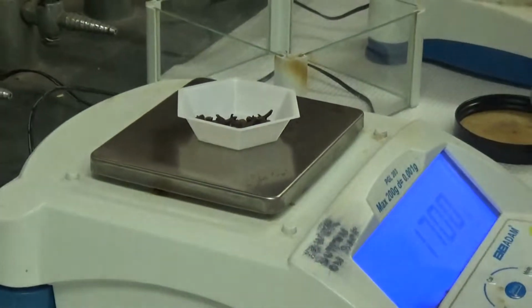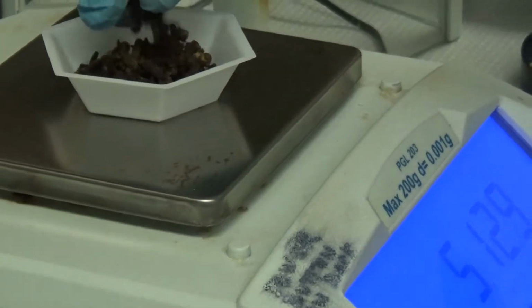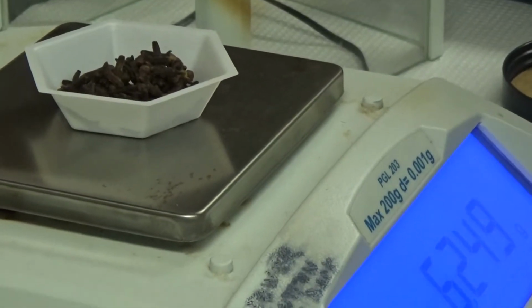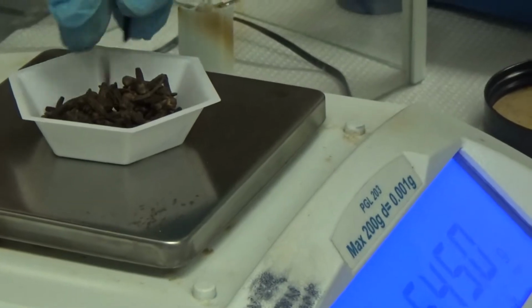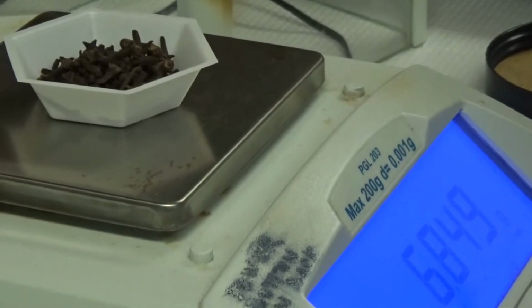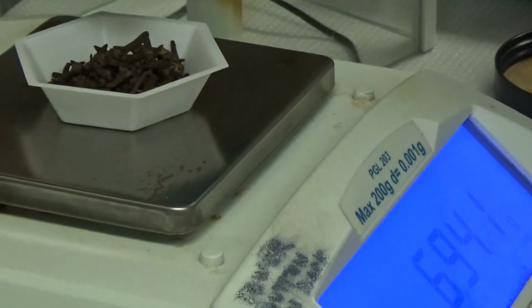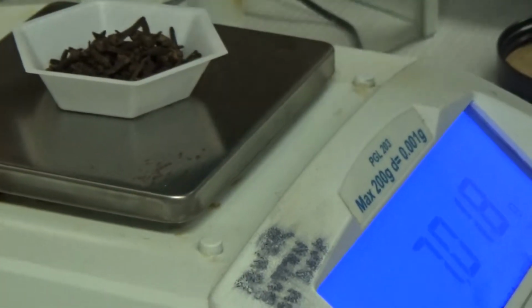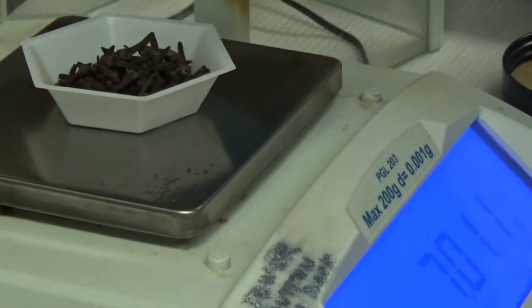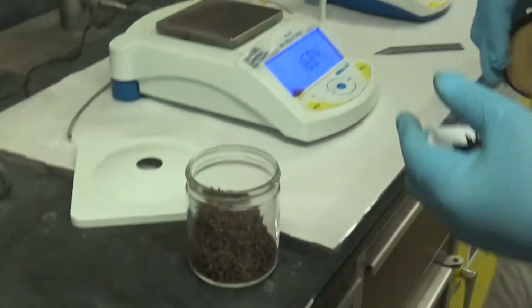I can even go with hands. Yeah, just use your hands. That's 1.6 grams. 5.1. 6.2. 6.7. 6.8. Almost there. 6.9. Just one little one. And we're basically there. Close enough. 7.01 grams. This means 7 grams. Basically 7 grams.